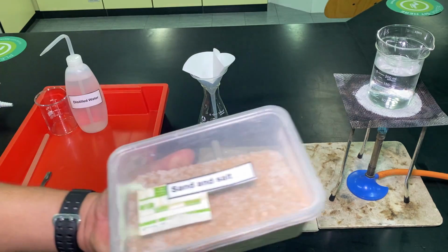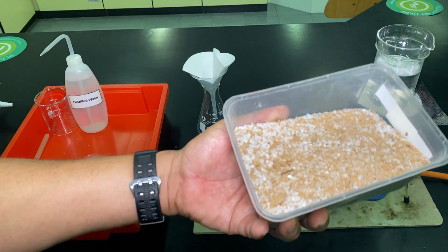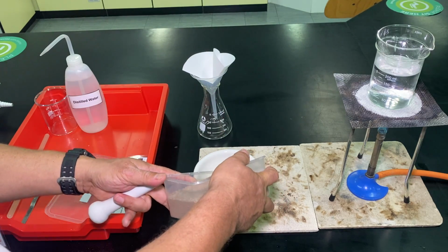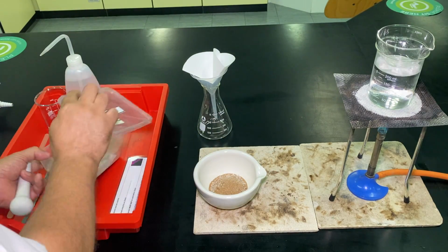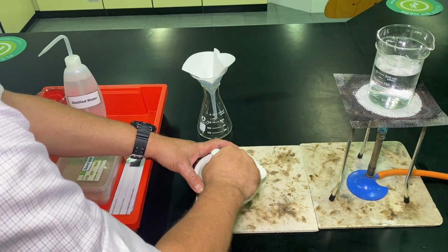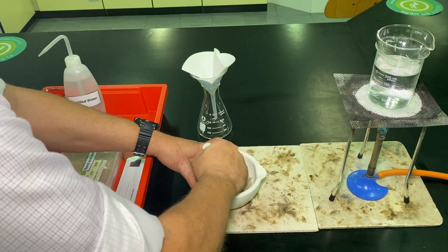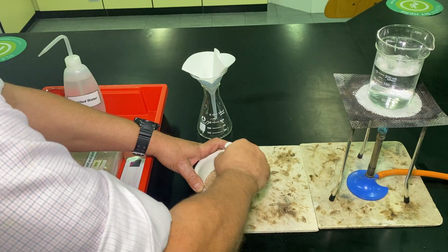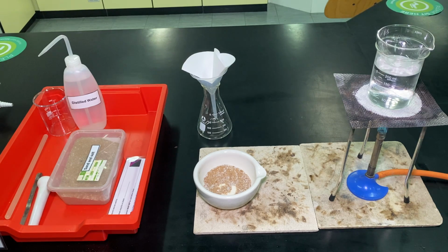Right, so before we start, because the salt, as you can see there, is all in big crystals, we want to crush that, because the first part of the process is going to be dissolving. We want to dissolve the sodium chloride. The sodium chloride is a soluble salt, so we can dissolve it in water.